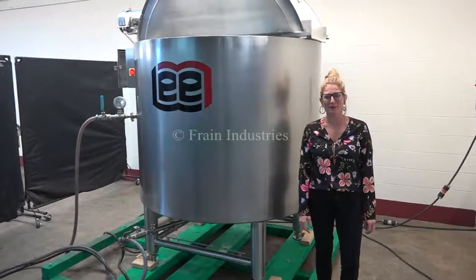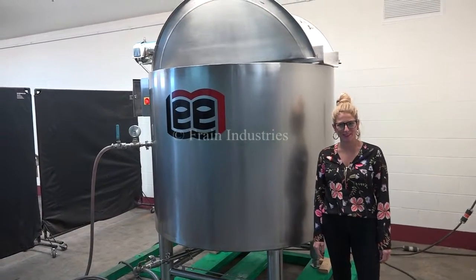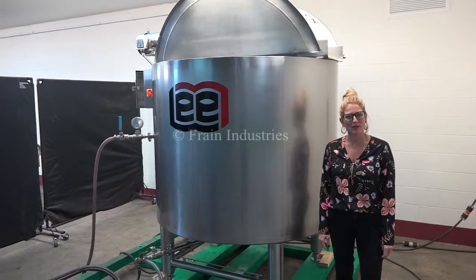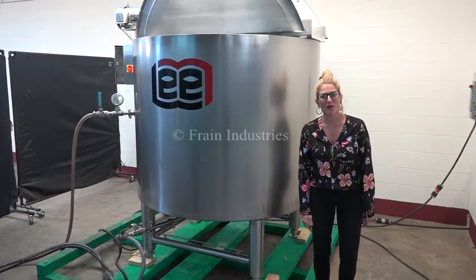Hi, I'm Katie with the Frain Group. Today we're cycling your Lee 400 gallon jacketed mixing vessel. We recommend you read the manual in its entirety before powering up the machine. The voltage is currently set to three phase, 480 volts.